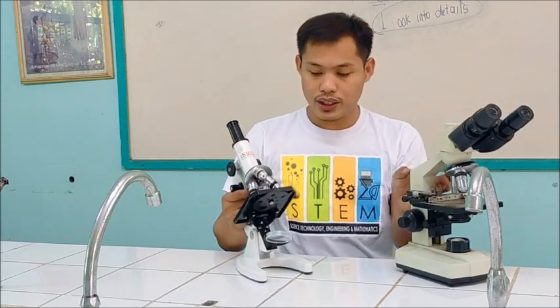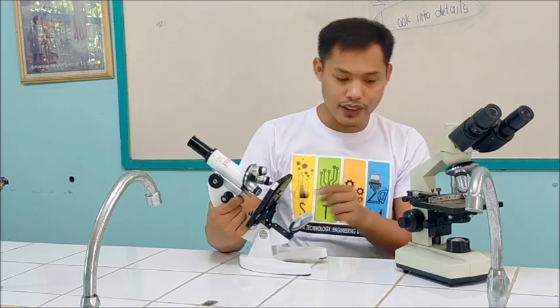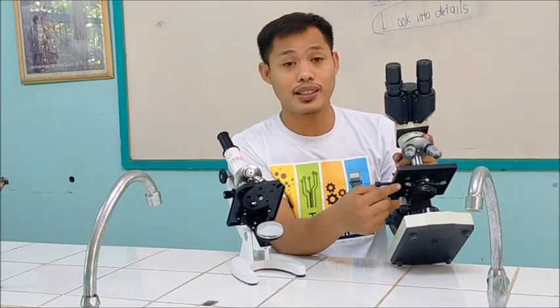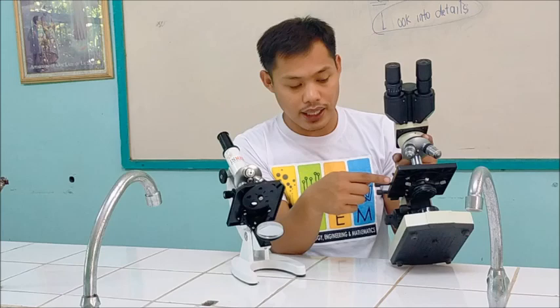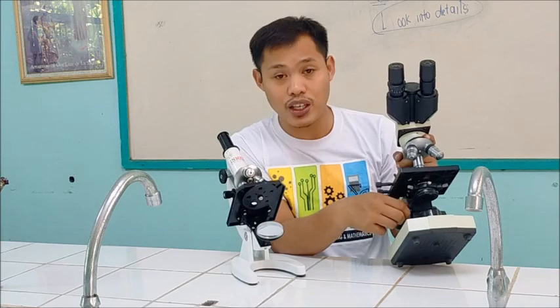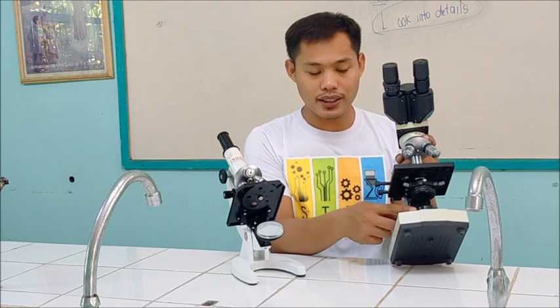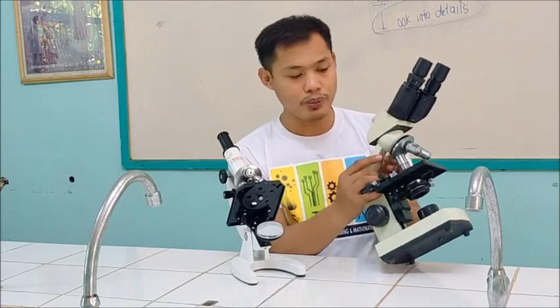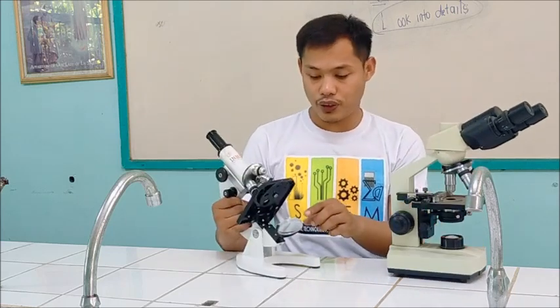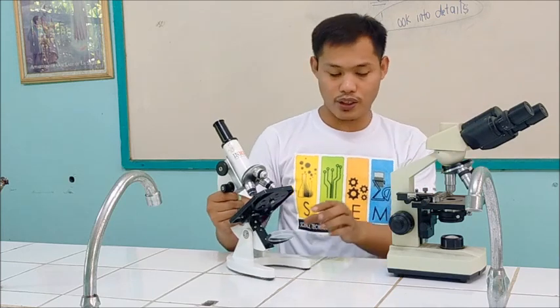Now, below the stage, we have the iris diaphragm, which contains the knob itself. It regulates the light that passes through the stage from the light source. It is actually adjustable. We also have the light source. For the light source of our binocular microscope, we have this here, and it comes from electricity. For our monocular, it's the mirror. The mirror serves as the light source of the monocular.